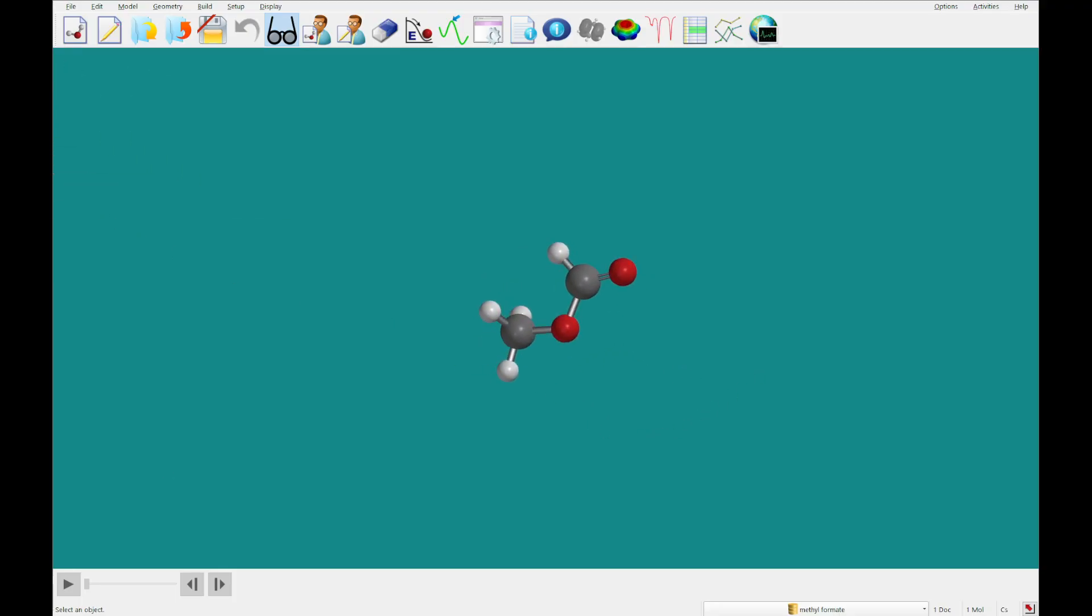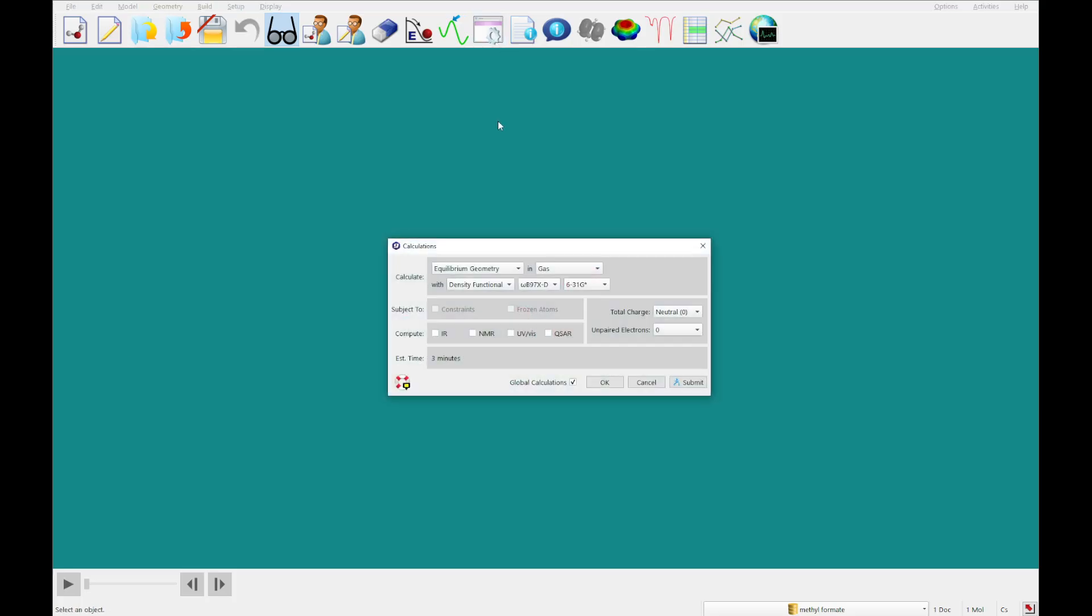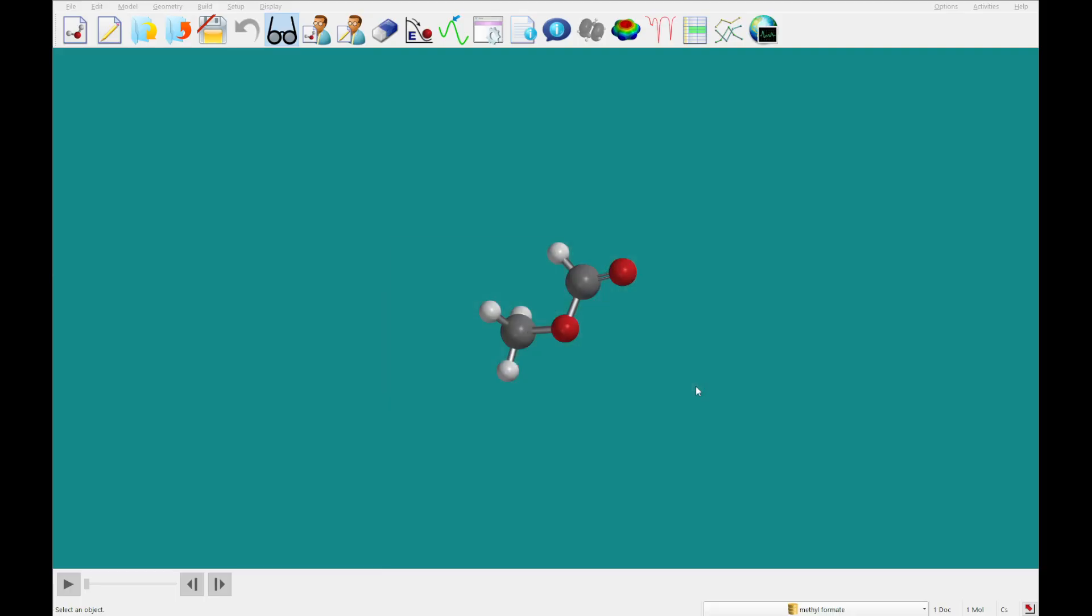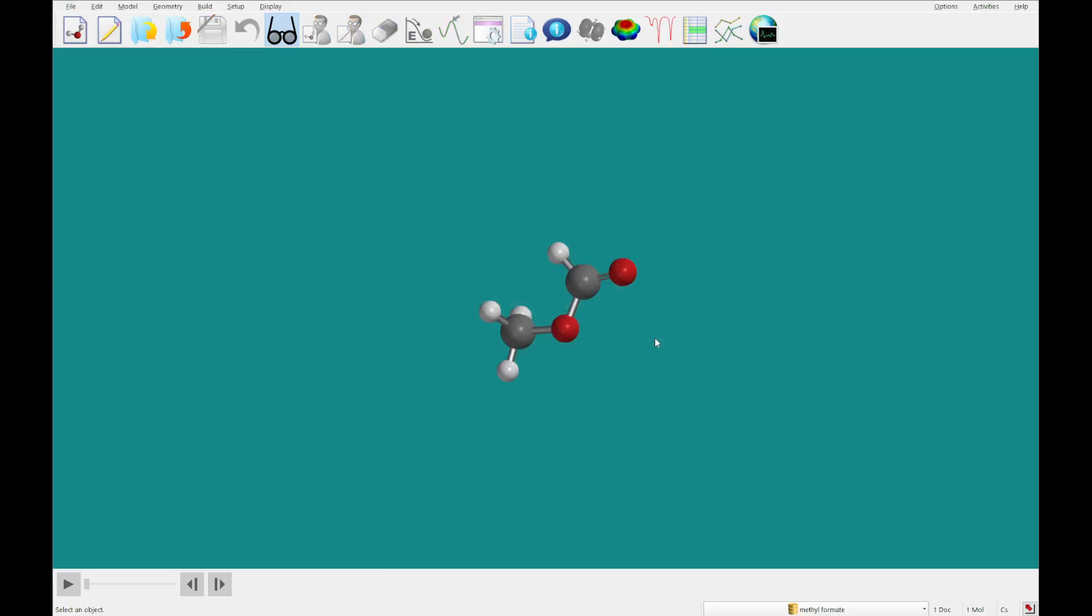Okay, so we've got methyl formate built, and what we're going to do is set up an EDF2 calculation, so we're going to switch this theoretical from OmegaB97XD to EDF2. We're going to check the IR box, and we're going to run this calculation.